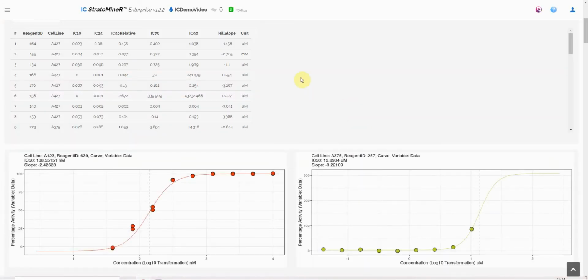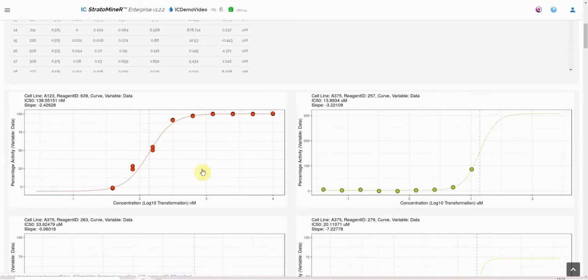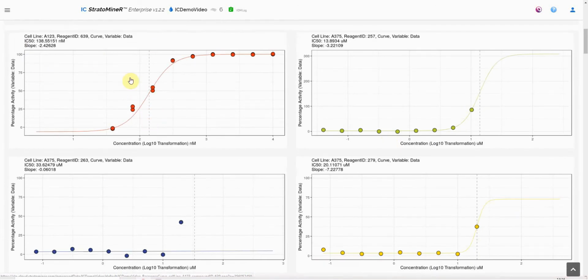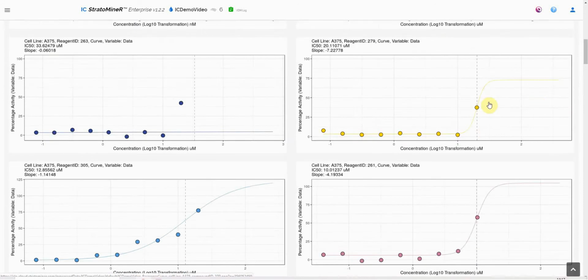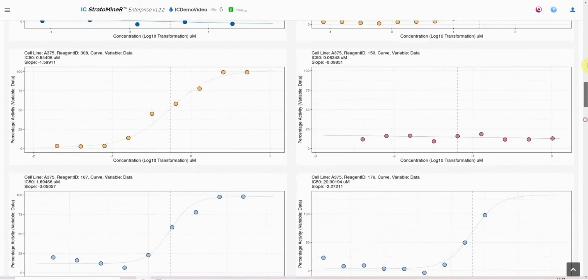And now you can see that there is a data table here, and our curves are down here. What it has done is recognize the replicates according to common reagent names, reagent classes and common concentrations, and these are recognized as replicates, even if they are on separate plates. Then it fits a curve, and it is also calculating an IC50. The IC50 is midway between this line and this line. So it's a relative IC50. And so you can see all of your curves here have been plotted.